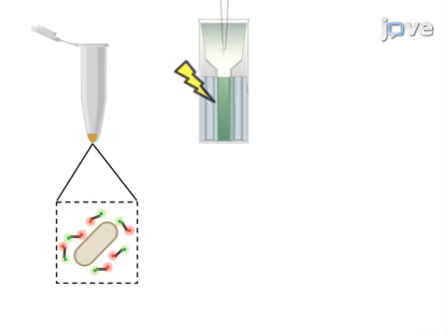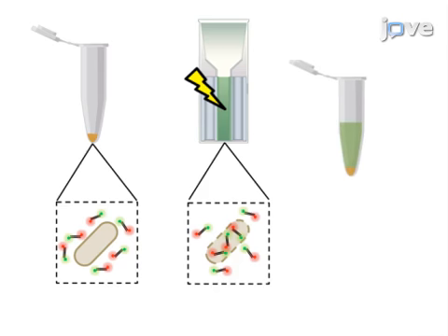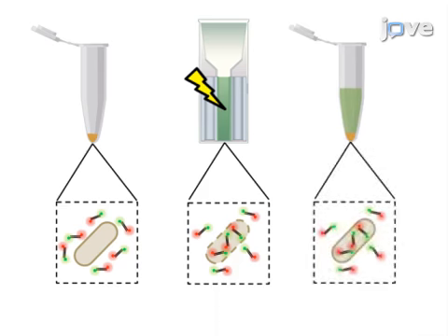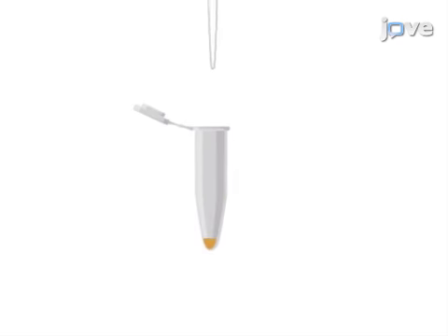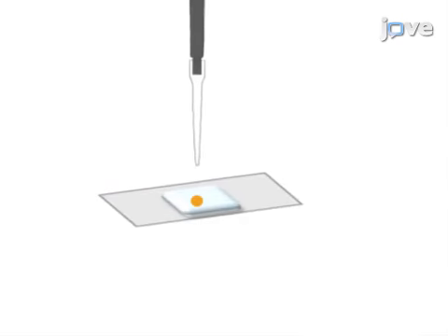By applying a high voltage across the cuvette, transient pore formations on both the cell wall and cell membrane will enable biomolecular diffusion into the cells. Next, the cells are incubated in a rich medium to allow them to recover, before the excess non-internalized biomolecules are removed. Finally, the cells are transferred onto a low-fluorescence minimal nutrient agarose pad, and then a glass cover slip is overlaid on top to form a glass agarose sandwich.